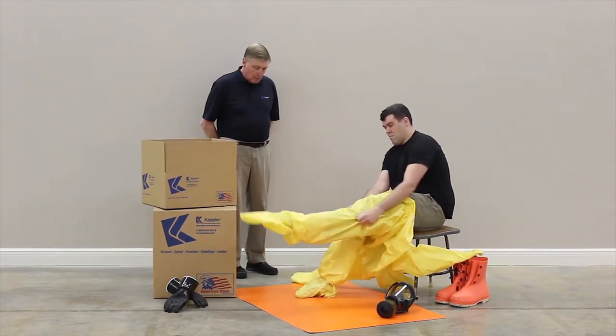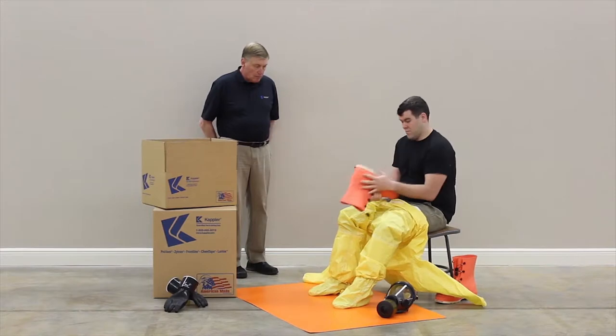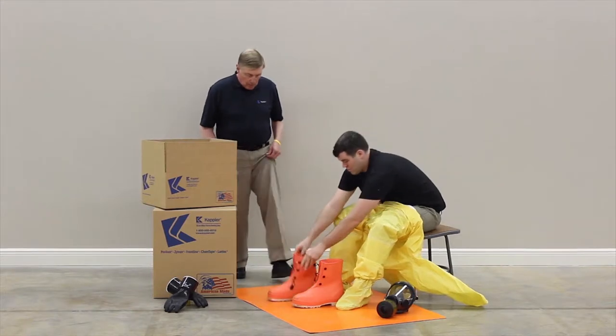Stretch the legs out to maximum extension while pulling the garment up around your hips. Visually check the size and condition of the outer boots and place them near the donning location.